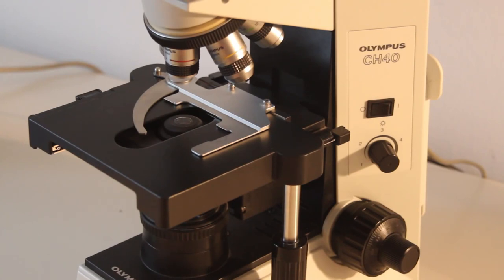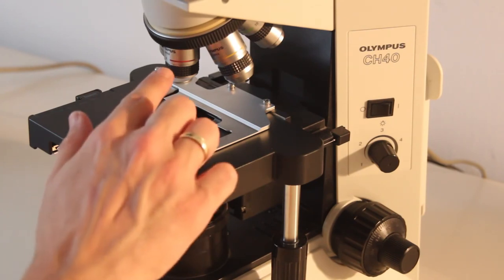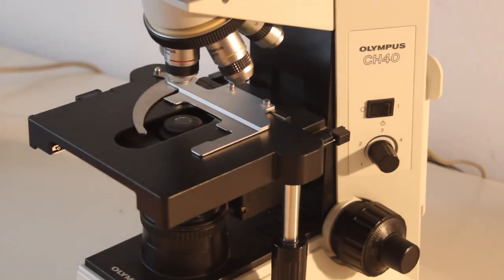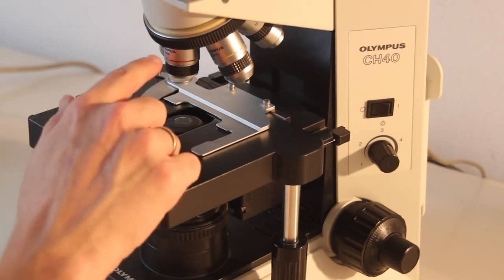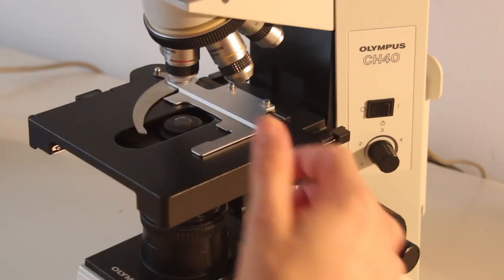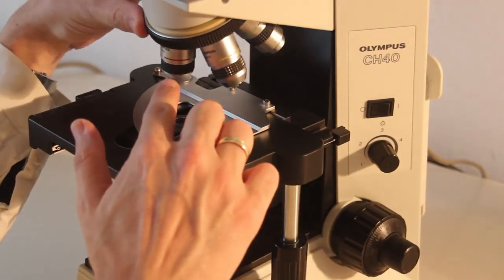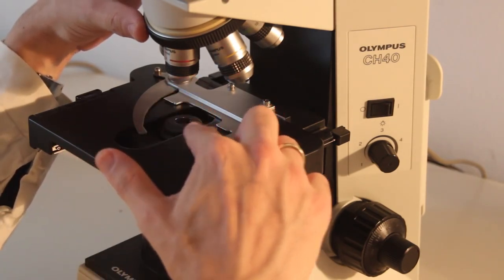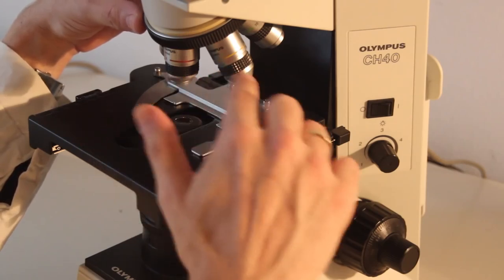The microscope is now plugged in, but before we can turn on the microscope there are a few things we have to take care of first. We have to make sure that the correct objective is rotated into position — you always start off with the lowest power objective first. This is the 4x objective, which is also color coded with a red ring. Be careful when rotating it into position that there is sufficient space between the stage and the objective, otherwise there is the danger of crashing the other objective into the stage.